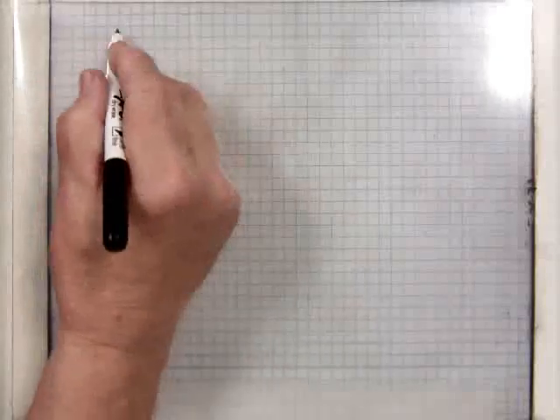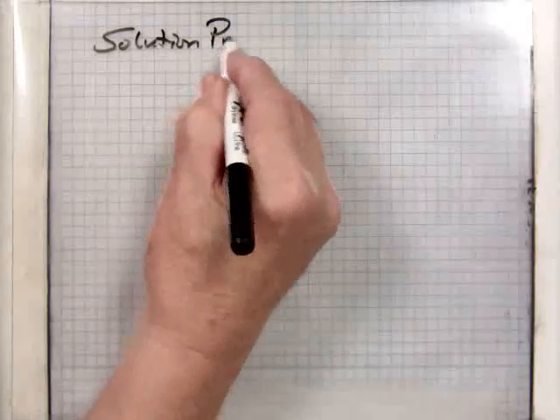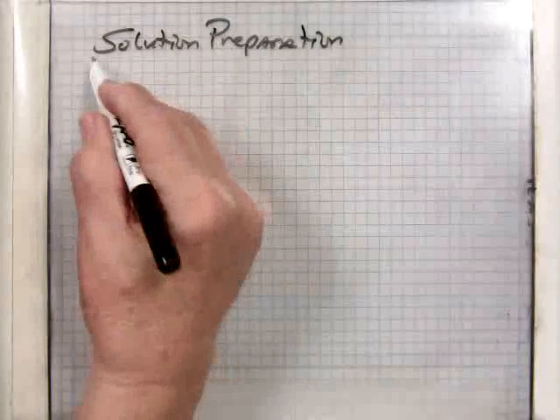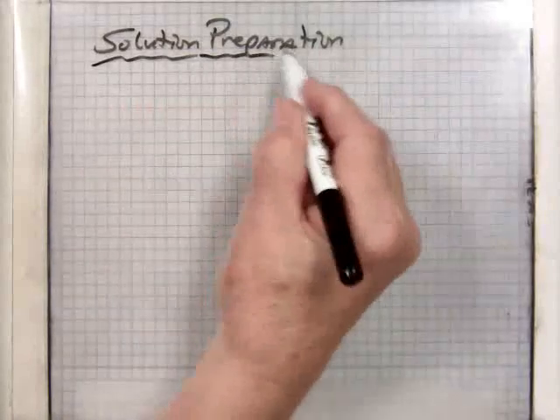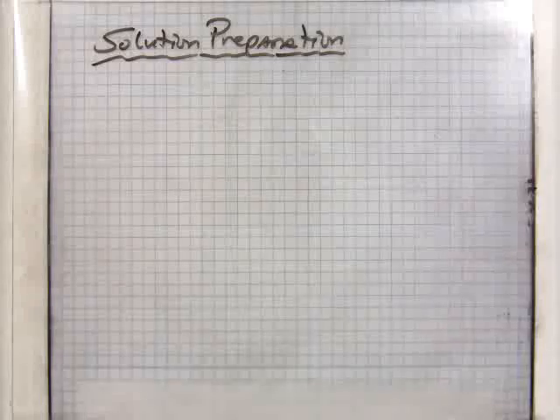And this is going to be solution preparation. Solutions can be prepared from one of three sources.